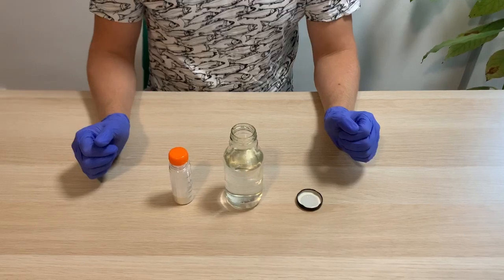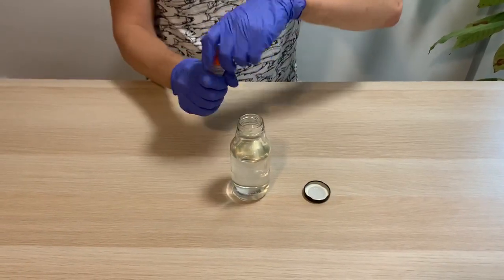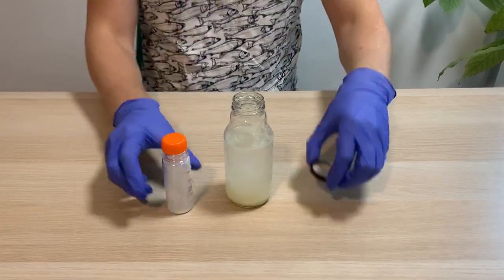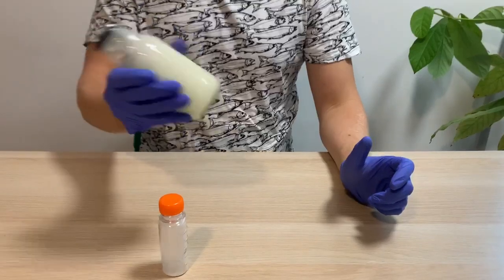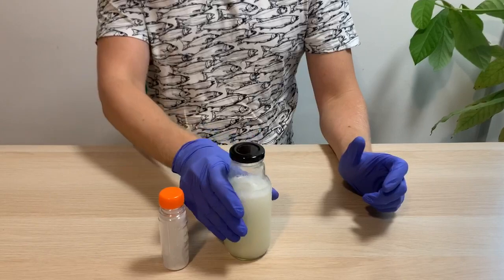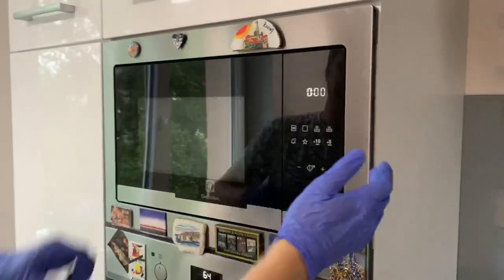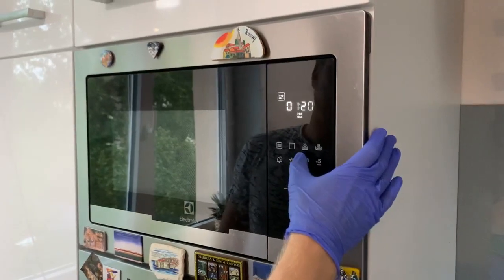First of all, agar media should be prepared and transferred to petri dishes. Empty the tube with agar powder into the bottle with clean distilled water. Close it and mix well.